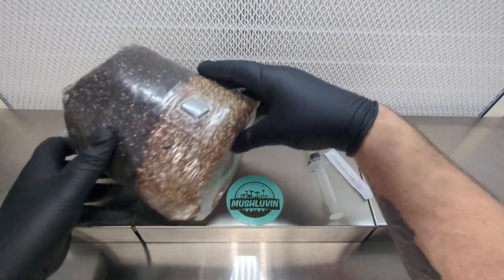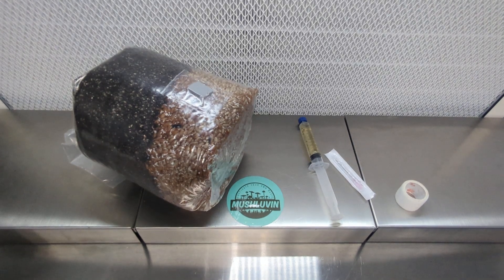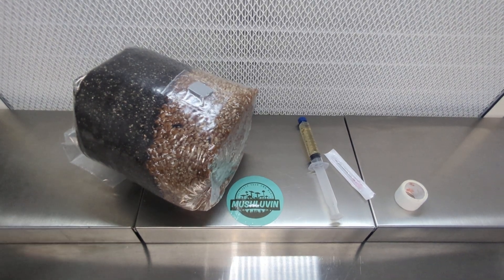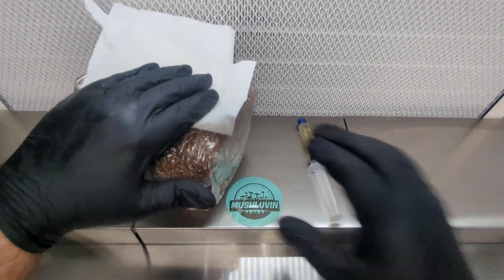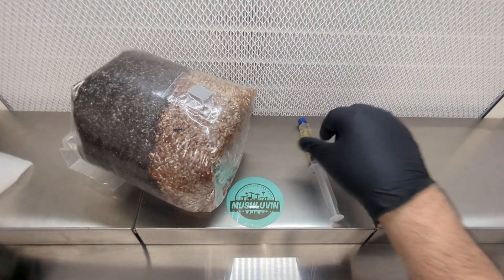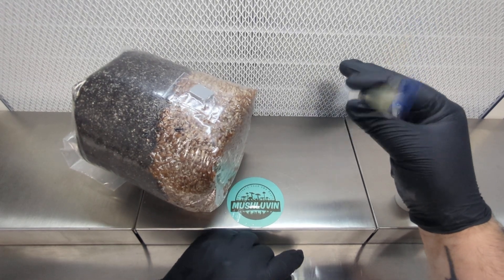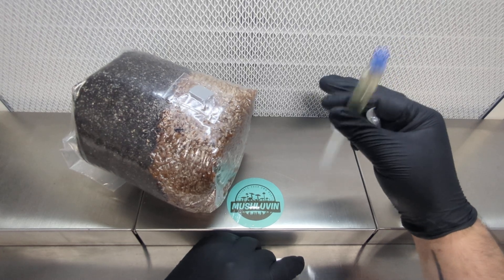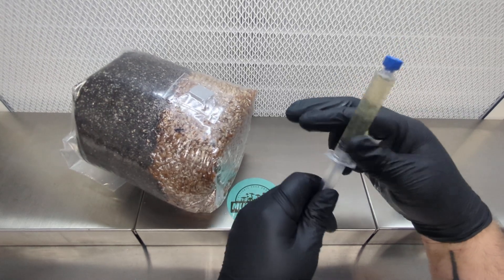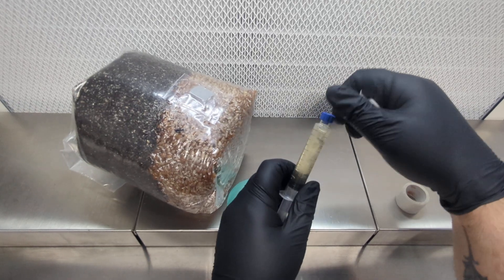So we're going to go ahead and jump in. I'm going to do one quick spritz on my hands just to make sure there's nothing sitting on them that could cause contamination. I'm going to give one more spray on the injection port. You want to make sure that you shake up the syringe really well. Mycelium will clump up if it's left at room temperature which could make it hard to get out of the syringe. So just mix it up and let's go ahead and do it.